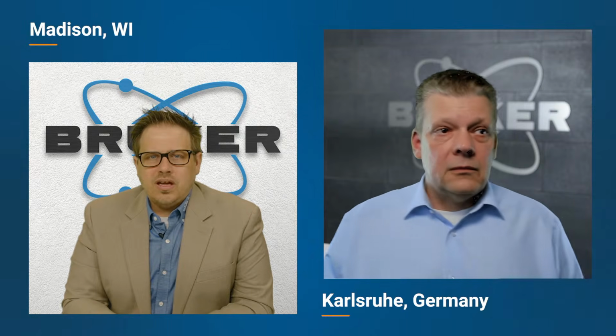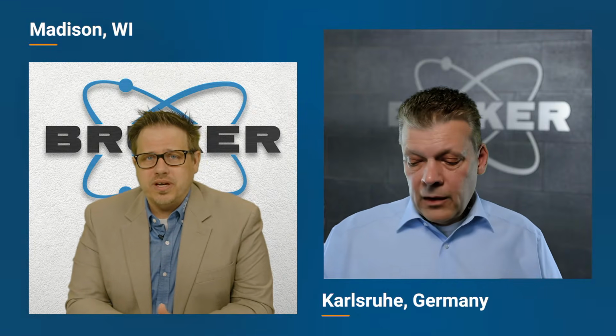Yeah. And what different metal industries do we see? Is this only a steel technique, or is it used for other metals?